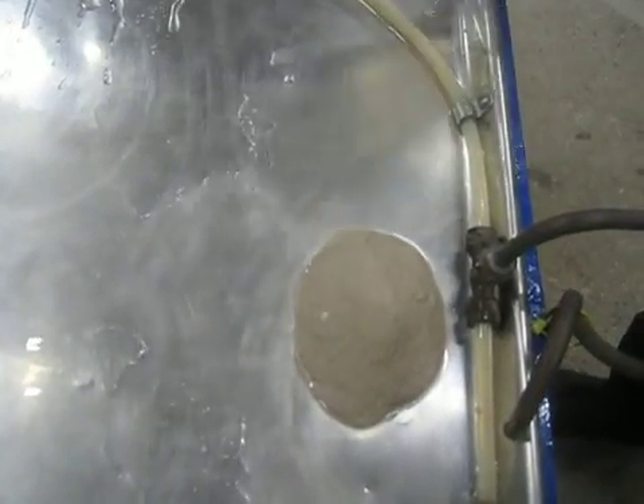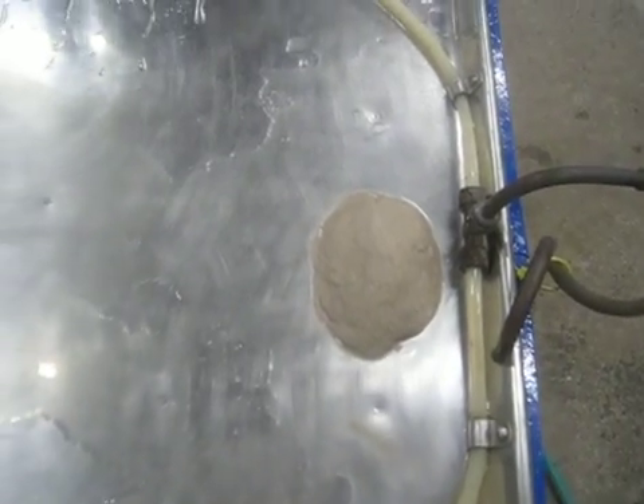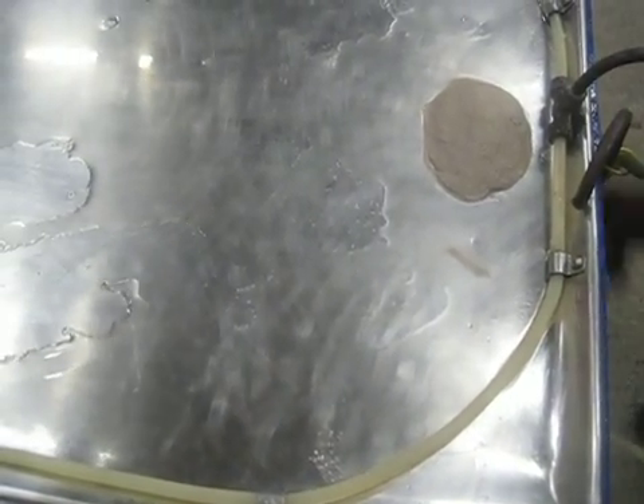Once the sample has been fully and thoroughly soaked, we can begin the test. We'll turn the wash water on and start the motion, and the separation can begin.